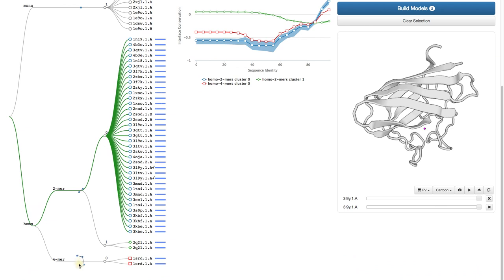If in another template the first and the last protein chain would interact, it would be shown in a separate cluster. Perhaps it would look like a closed necklace, for example.